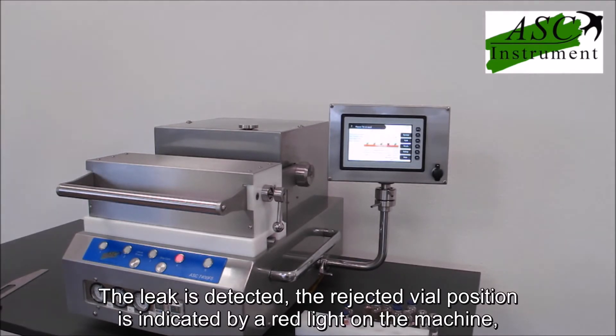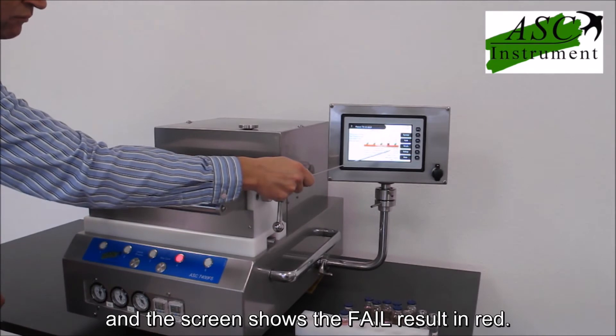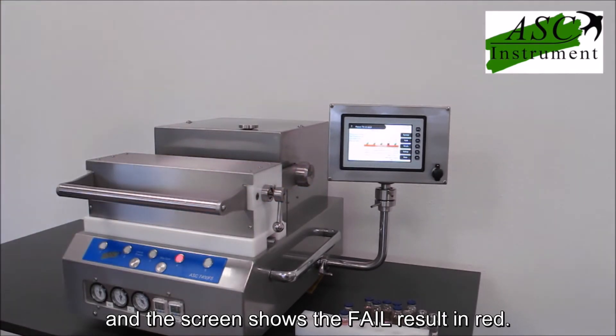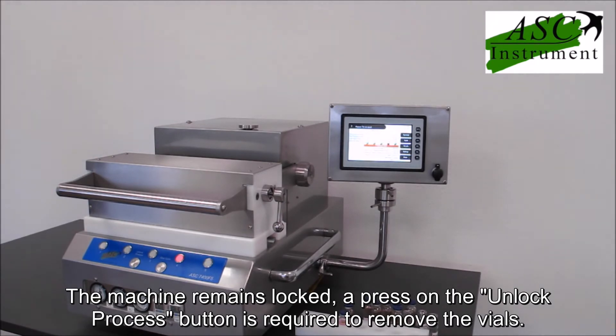The leak is detected. The rejected vial position is indicated by a red light on the machine and the screen shows the fail result in red. The machine remains locked. A press on the unlock process button is required to remove the vials.